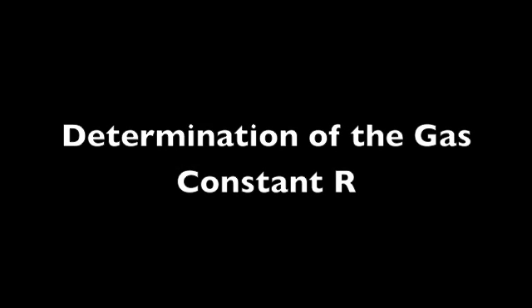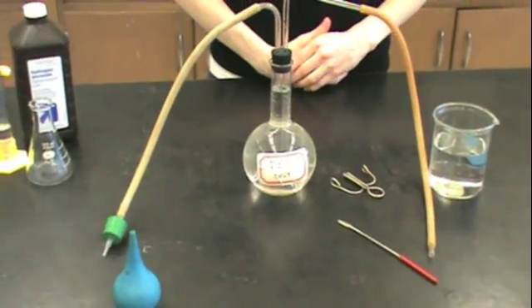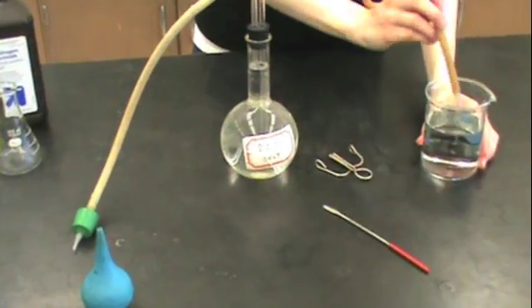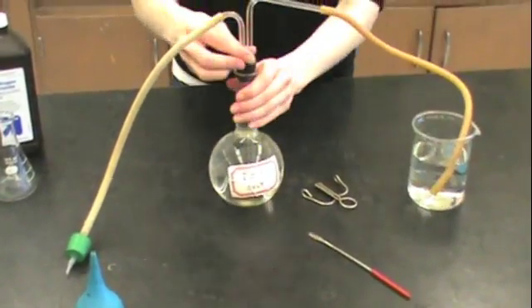Here we will show you how to perform the experiment for the determination of the gas constant R. You will need a Florence flask filled to about an inch from the top with water, a 400 milliliter beaker filled with water, and a blue bulb.